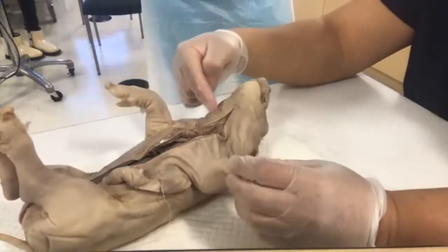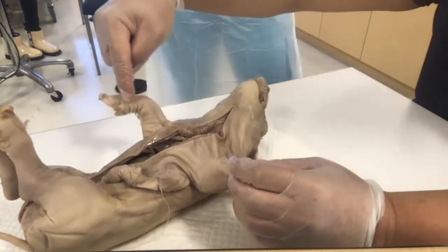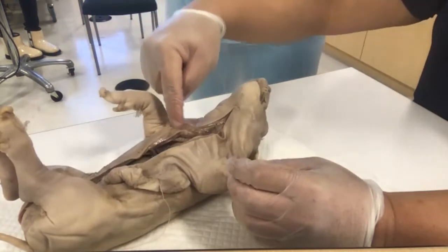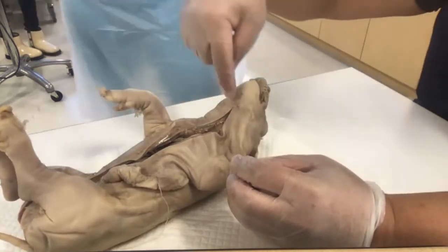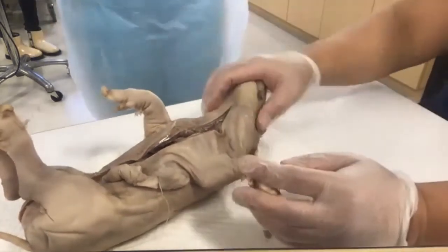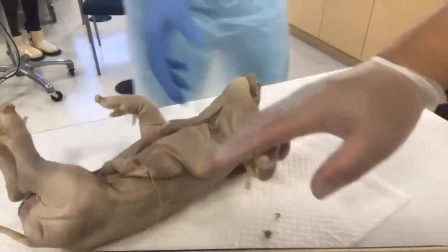Now I have to ask our surgeon to cut here. Now you can assist. You cut all the way up to here, from here, and then here, like this, just as in the textbook, and I'll open it up. Not the textbook, our little dissection. I'll open it up to that section. Your job, you can sit here and hold it. Your job is to make sure to cut the pig and not hurt yourself. Okay? So communicate with each other.